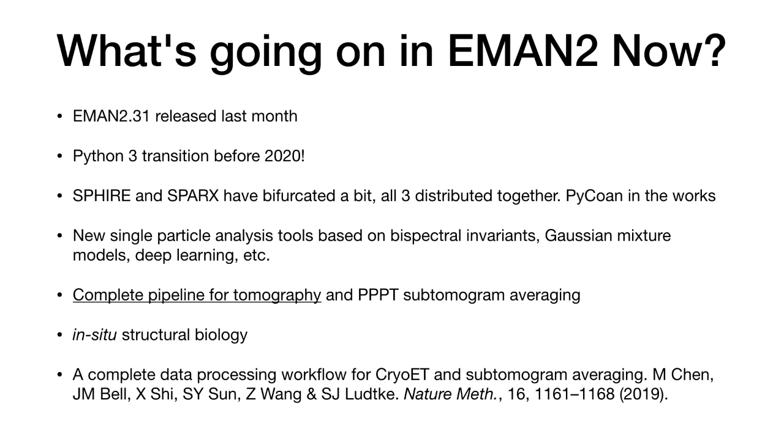What I will be talking about today is this new pipeline that we've developed for tomography and subtomogram averaging. This is moving into the field now of in-situ structural biology, which is really a new field. You might have heard Wolfgang Baumeister talking about it as early as 20 years ago. He was introducing this concept and pushing it as a concept. But progress has been very slow until some of the recent developments, which led to single particle analysis really taking off, have now also led to this in-situ structural biology also becoming more possible.